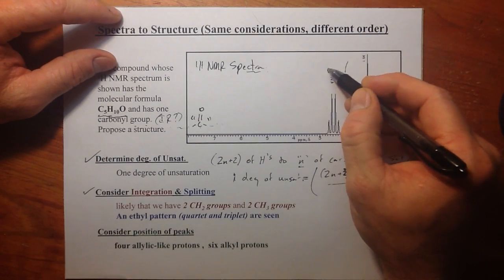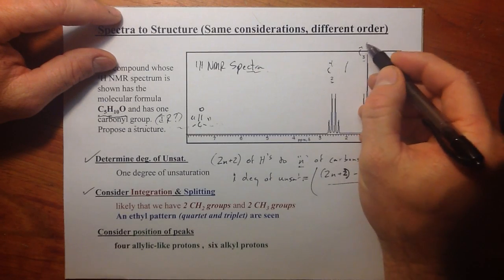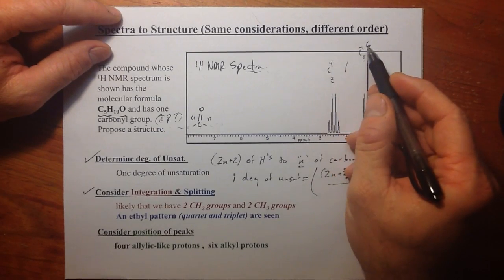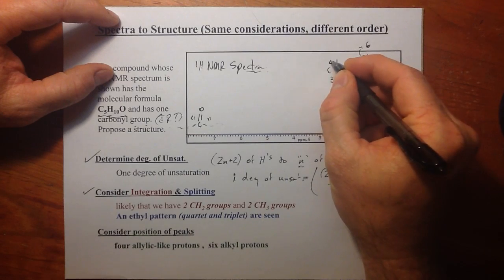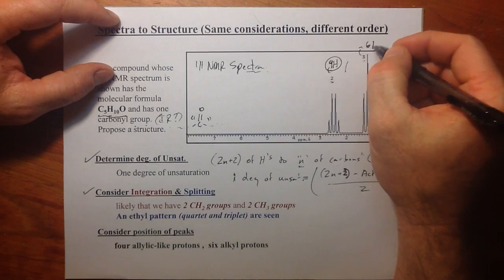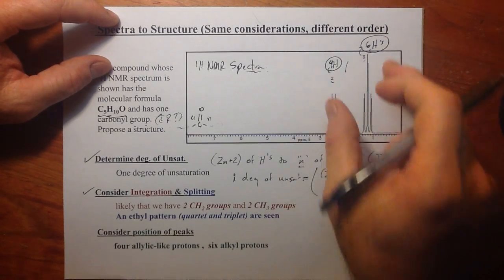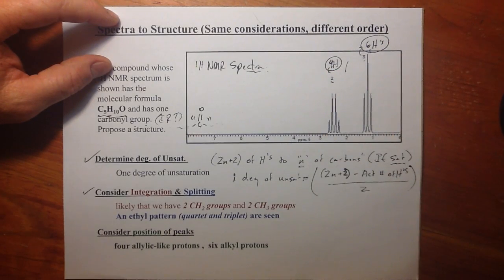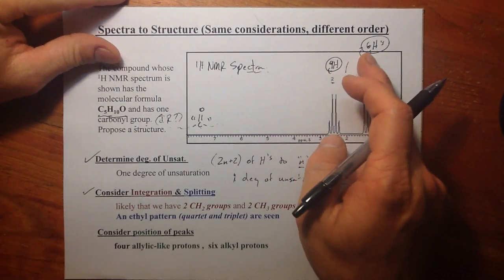So what we do is just double both sides. We say, well, what if it was a 4-6 combination of hydrogens? 4 and 6, oh, that totals 10. So now, put it in pen, you can say, I know I have 4 H's under this signal and 6 H's under this signal. You can put it in pen right on your data. From the integration, I know I have this number of protons that represent each signal: 4 H's and 6 H's.